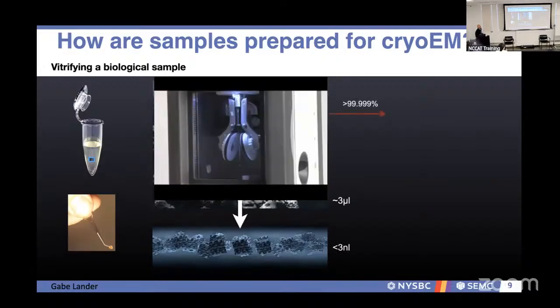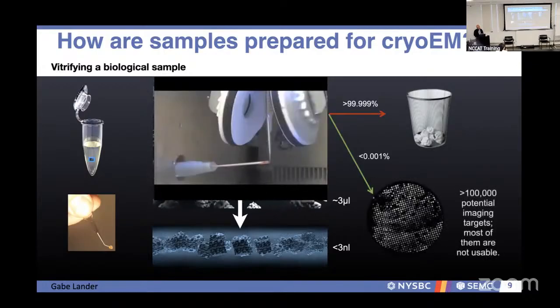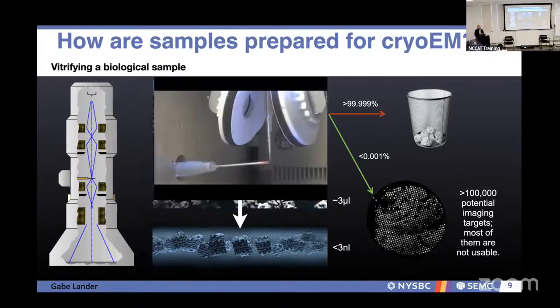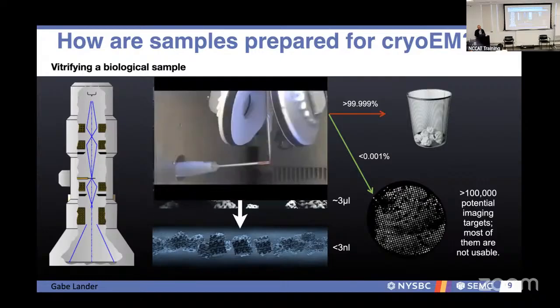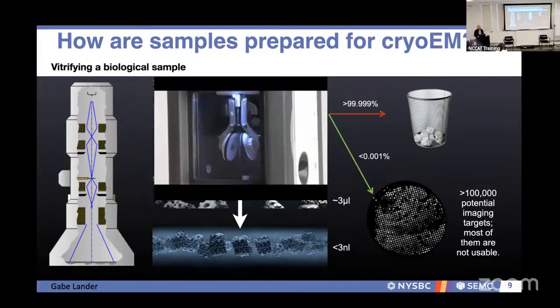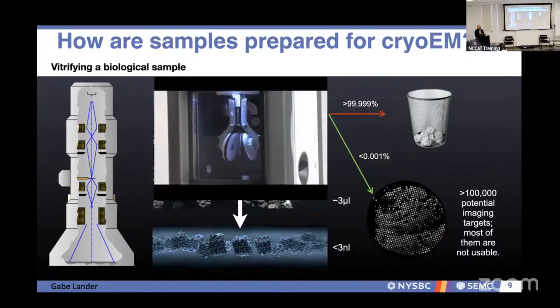Normal volumes we're dealing with are on the order of a few microliters. And if you're trying to do that calculation, if you just have a 100 nanometer thick volume that's vitrified over roughly that 3 millimeter metal mesh, you only need an order of magnitude less in terms of volume, actually several orders of magnitude less. But it's very hard to do a lot of the sample manipulation we want to do reproducibly. And what you can see on the bottom right is that an EM grid tends not to be so uniform during your sample prep.